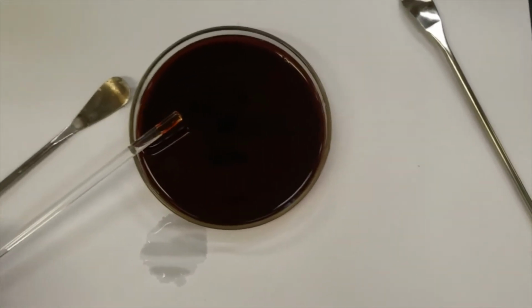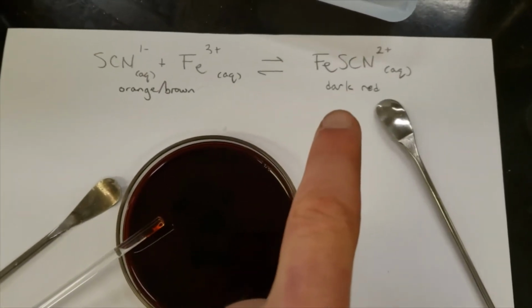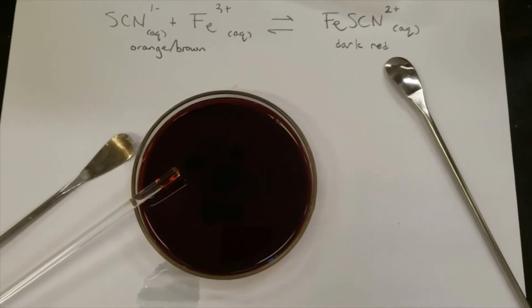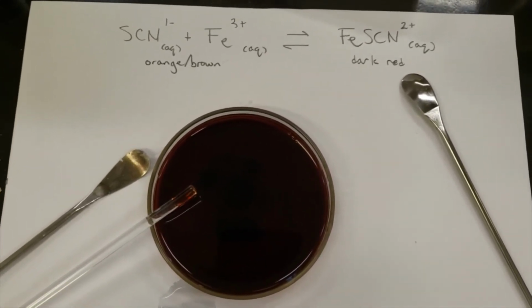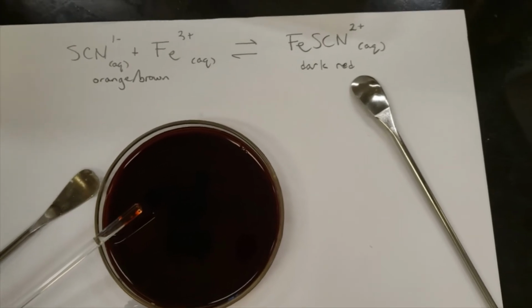The dark red color tells me that the solution is heavily favored towards the right-hand side of the system. Now, this may not look like an equilibrium system, but what we'll do is change the concentration of the ions to show that we can apply Le Chatelier's principle to this system.